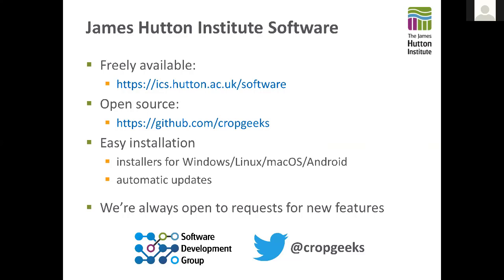Where I guess it's more of a niche space for us to fill with things like Flapjack, whereas there are other options for NGS visualization tools, which is slightly annoying for us because the longer we spend not developing Tablet, probably the further behind the rest of the tool space it has fallen. But that's just the way it works. We have a team of bioinformaticians here of about 12 or 13, and you've seen there's only 4 or 5 doing software development, and even there, the 4 or 5 are not 100% software development.